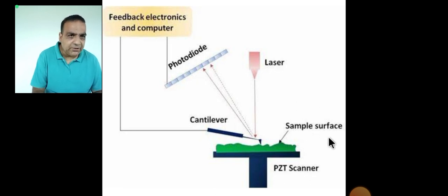So it operates by scanning a tip, a sharp tip across the surface of a sample and measuring the force between the tip and the sample.